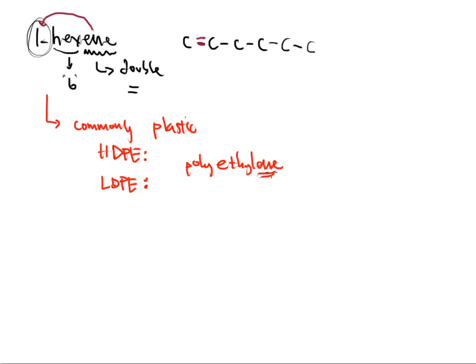So start looking at these names and start putting these puzzle pieces together. So 1-hexene is an organic. It's all carbon and hydrogen mainly. That's what it is. So this is an organic molecule. It is very nonpolar, meaning it's not going to mix with water very well. It's very insoluble in water, actually. The boiling point of 1-hexene is going to be 64 degrees Celsius, give or take a little bit. So you're not going to have to heat it up to boiling point of water before the thing evaporates off. And this is traditional of an organic chemical as well.